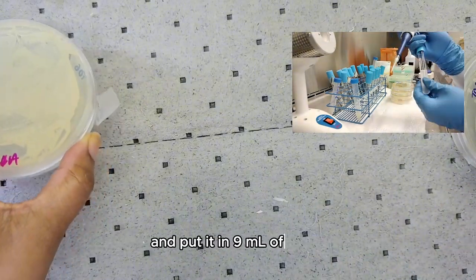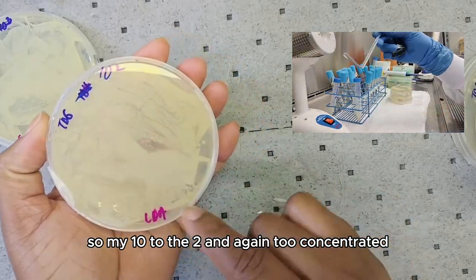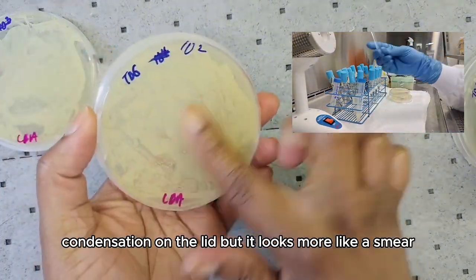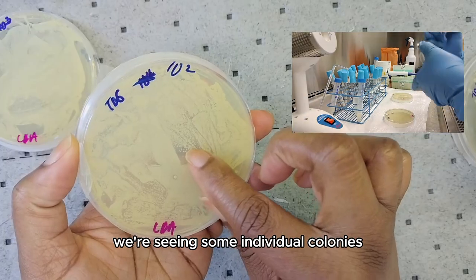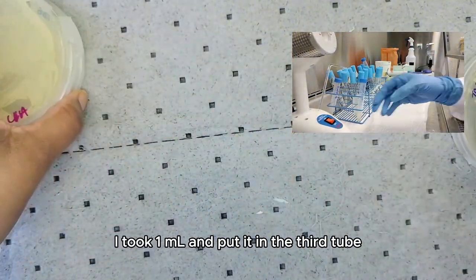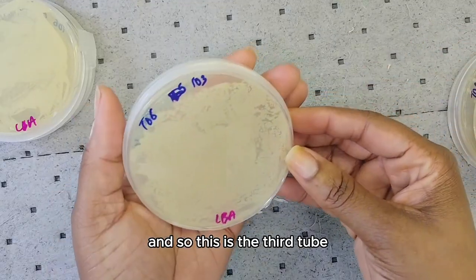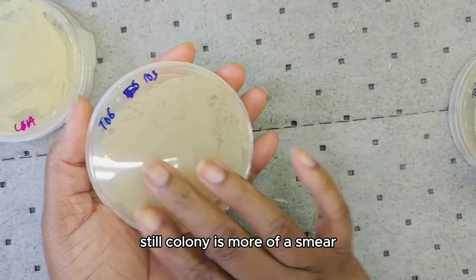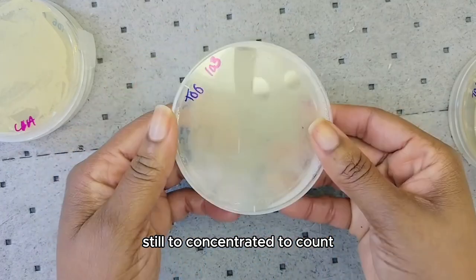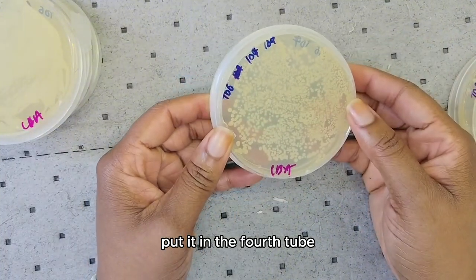I took 1 mL from the first tube and put it in 9 mL of water — that was my second tube, the 10 to the 2. Again, too concentrated; it looks more like a smear with some individual colonies, but still too concentrated to count. From tube 2, I took 1 mL and put it in the third tube containing 9 mL of water. This is the third tube — still more of a smear, still concentrated, with some individual colonies but still too concentrated to count.